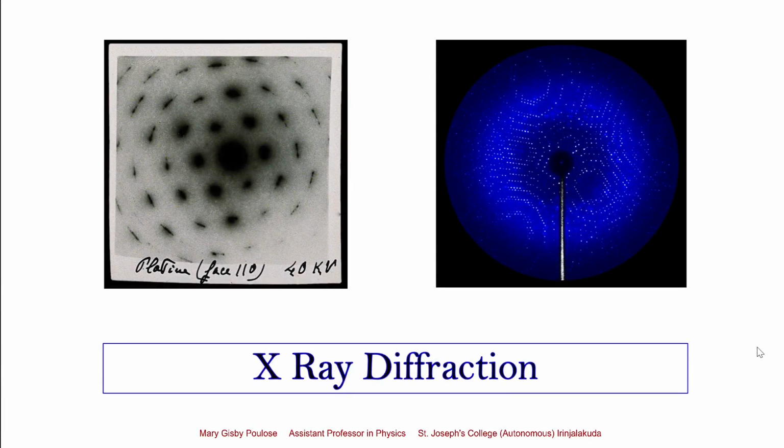Good day, students. Today we will look into X-ray diffraction. It is a non-destructive technique to study materials. To understand X-ray diffraction, we first need to recollect a few terms. That is, we need to remember what a crystal is, we need to know what X-rays are, and we need to remember what diffraction is.